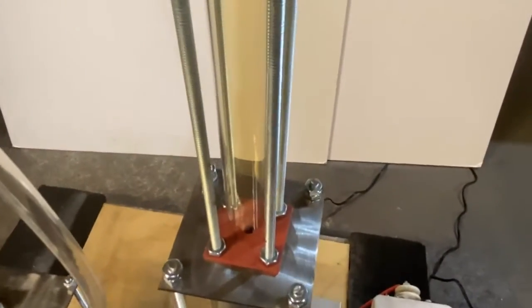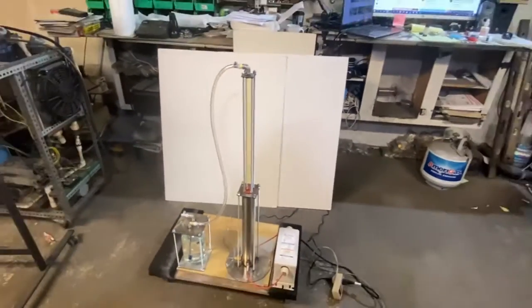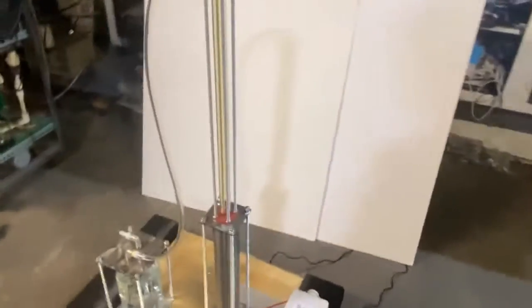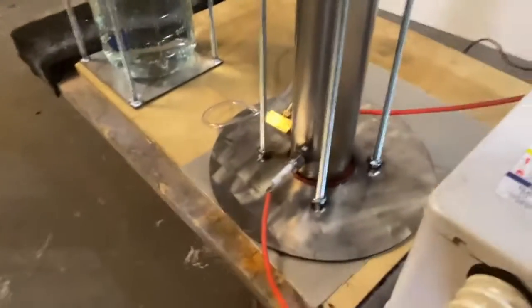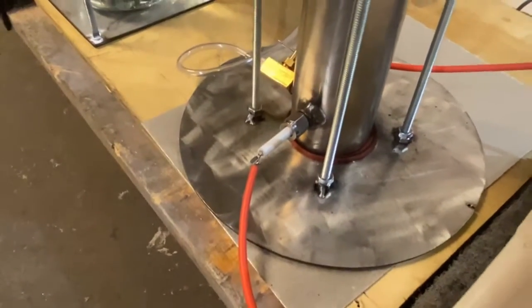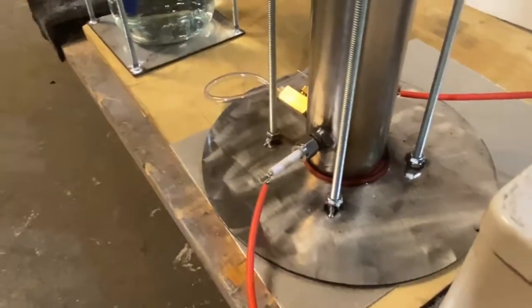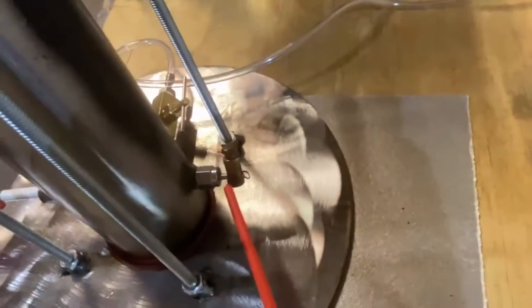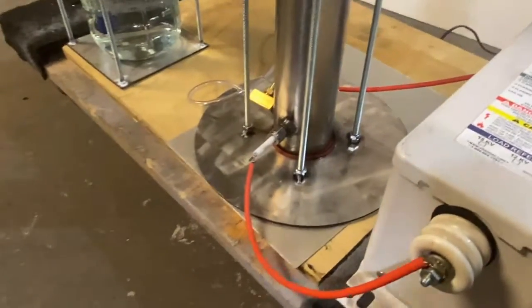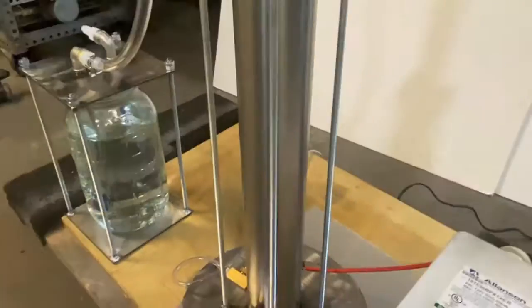I am quite pleased with how well it's doing with just one spark gap. Eventually, pretty soon, I'm going to hook up an array of these spark gaps. I wish I could have done them all like this side here, but unfortunately I ran out of parts. This side here is live, so the whole thing is electrified — you don't want to touch it. I'm going to get more of these ceramic electrodes and put a whole array of them up inside of this thing.